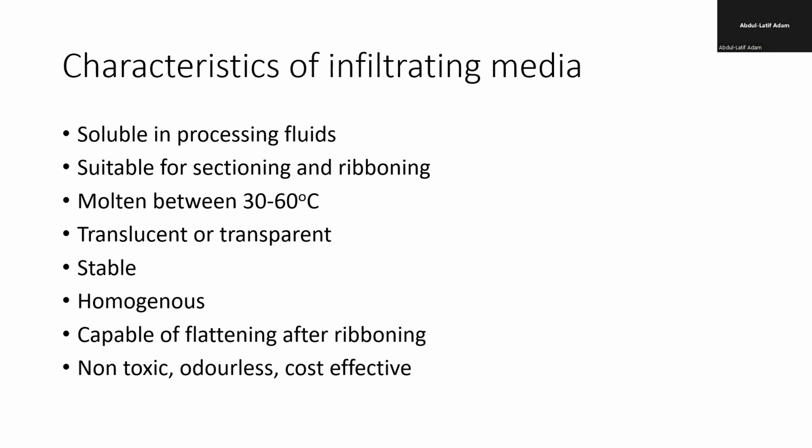Okay, so another factor about the infiltrating medium is that it should be stable. It shouldn't be that today it is transparent, tomorrow it is opaque. That today it is colorless, tomorrow it is green, black, white. No, it should maintain the same transparency. It should be clear, see through. You should be able to see through the embedding media, not see through like glass, but at least so that if there is something that is not supposed to be there, you are able to see.